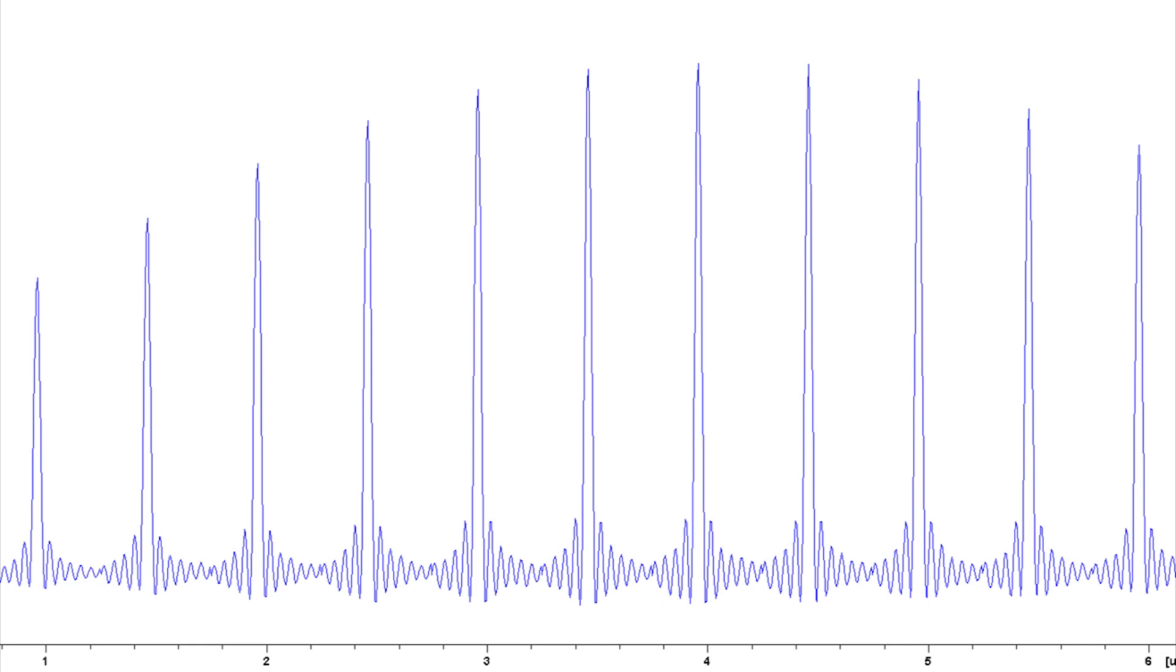Having done carbon, we then moved on to phosphorus and nitrogen and checked the standards there. And having been satisfied with that, we also did a couple of other nuclei that are common in our lab. That's being silicon-29 and selenium-77. Now, a few days later, the eject pipe came off, so we had to do a further fix on that.